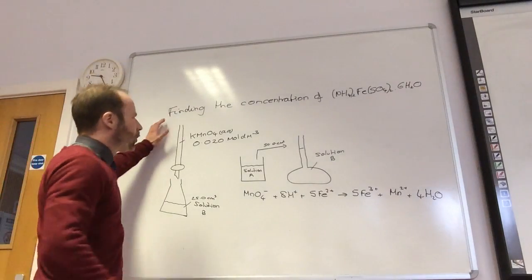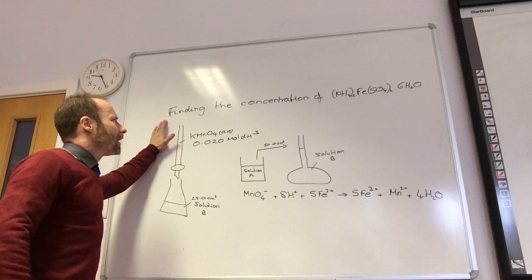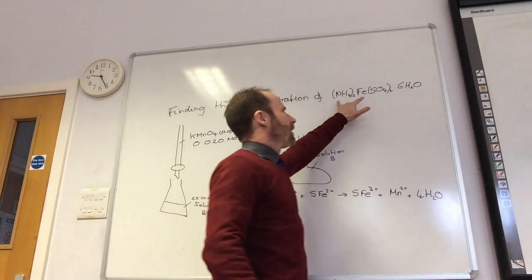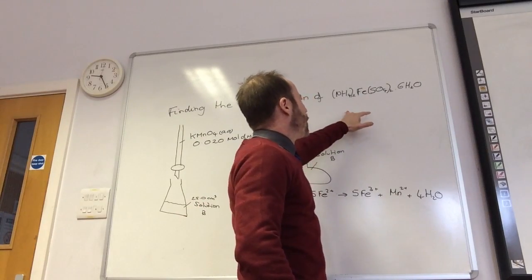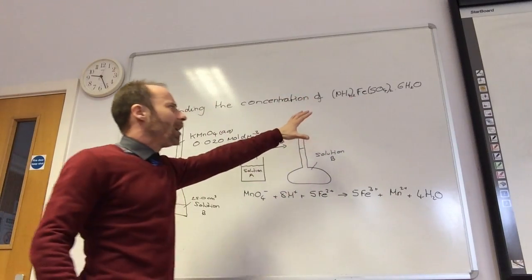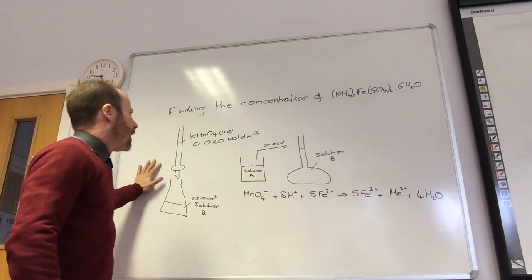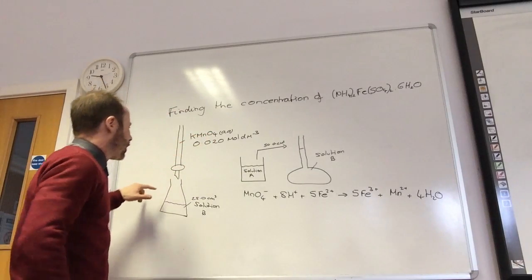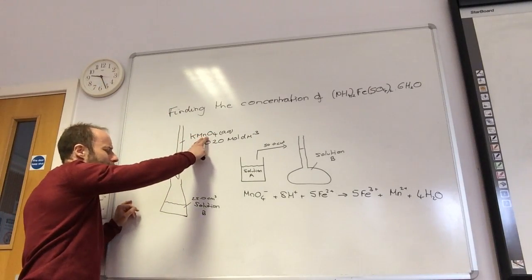So I want to just talk you through the practical that you'll be doing on Wednesday. We're going to try and find out the concentration of this, ammonium iron sulfate. This is our unknown concentration, and we're going to do it by a potassium manganate titration, which we've looked at. So the way it's going to work is I'm going to fill up my burette with potassium manganate.